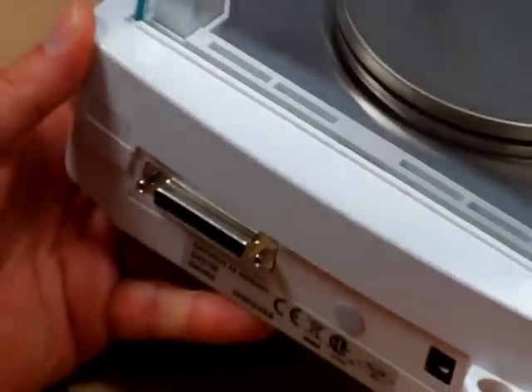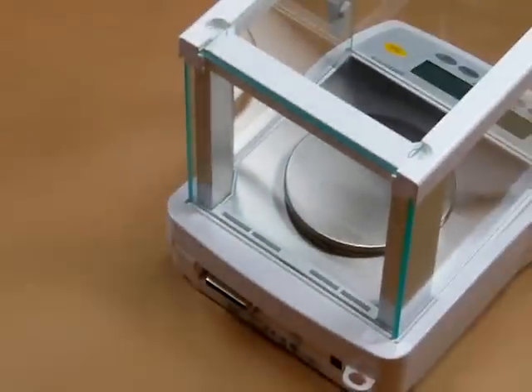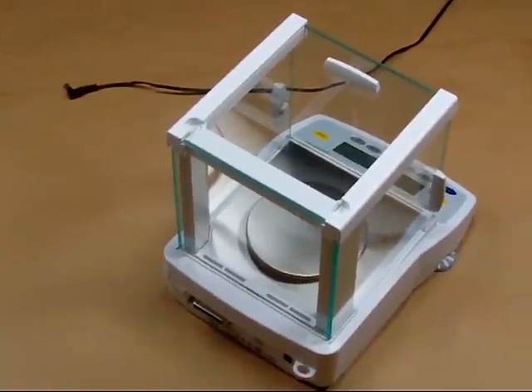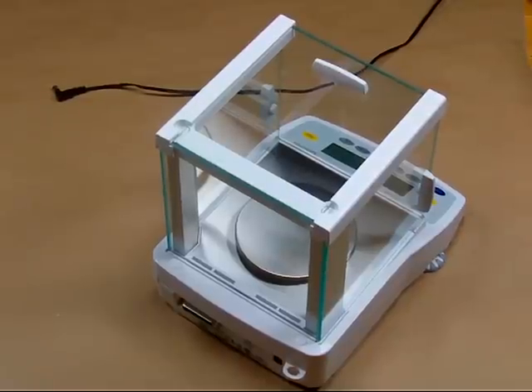The balance also comes standard with the AC adapter, and this balance is only operated by AC adapter. This is the Sartorius GK3102 — 620 grams by 1 milligram — and it's in stock at balances.com.